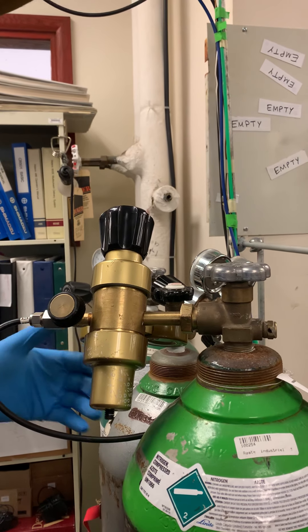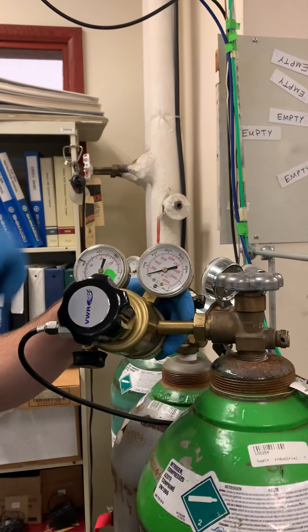Sometimes you're going to hear a little bit of gas expelling from it. That's usually the gas that's contained in here.